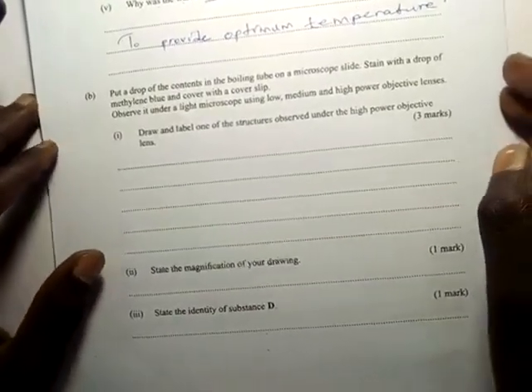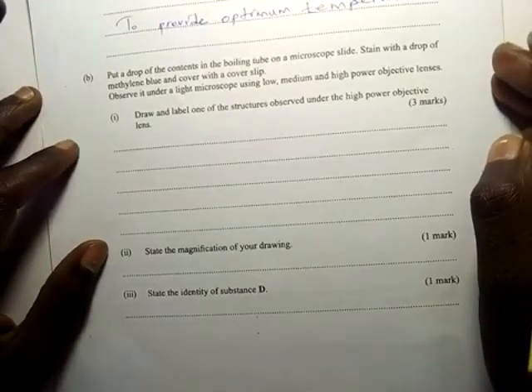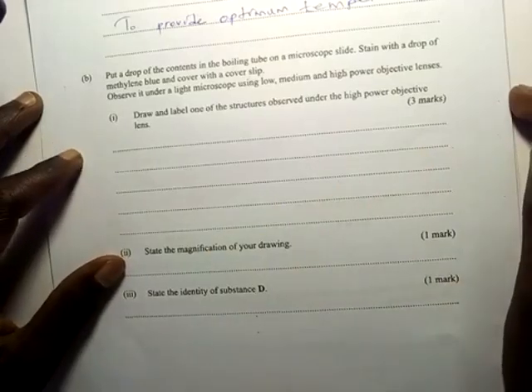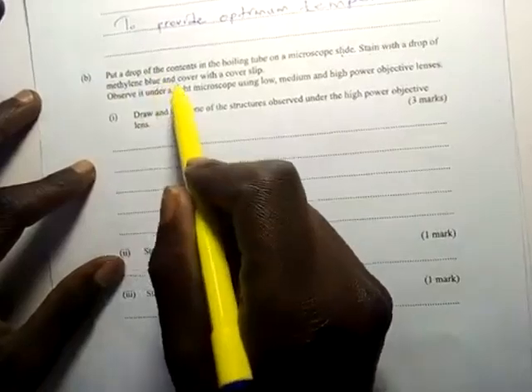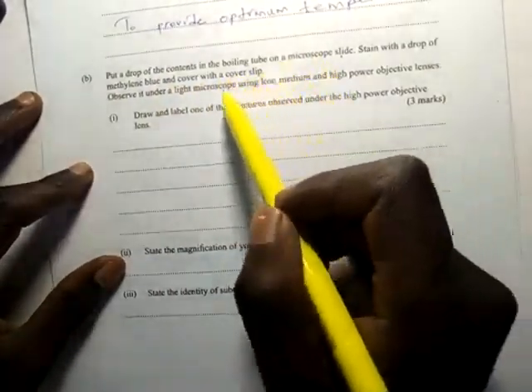Yes, and then in B it says put a drop of the content in the boiling tube on the microscope slide. Now here they are provided with microscope, and then stain with a drop of methylene blue and cover with a cover slip.